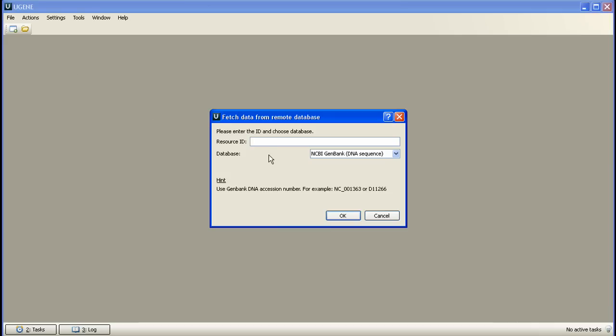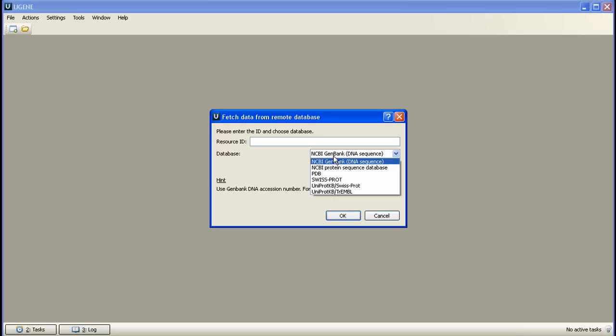In the dialog box that appears we are prompted to select a database to refer to and to enter the desired resource ID of the resource to load. At this point six databases are available and their number will be increased in the next UGENE releases.